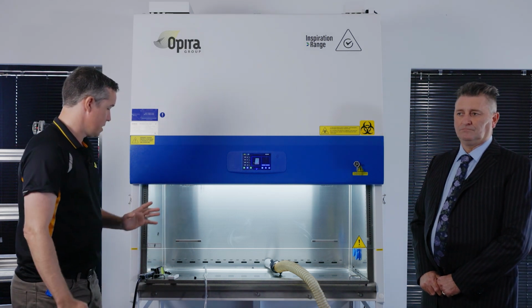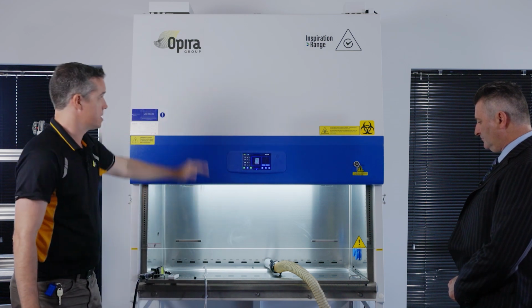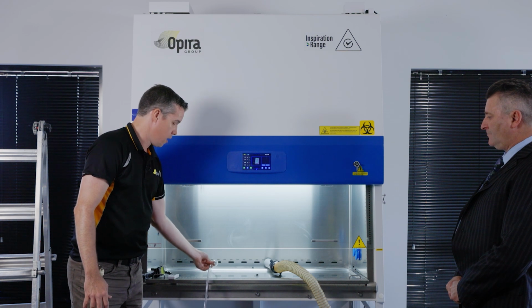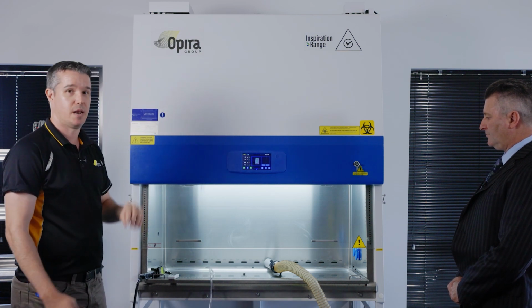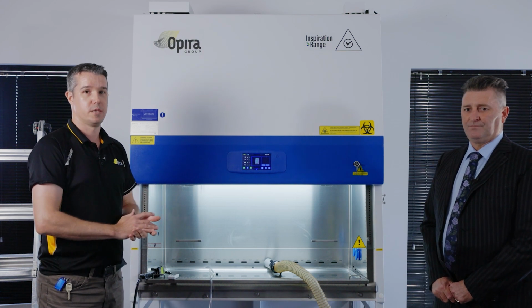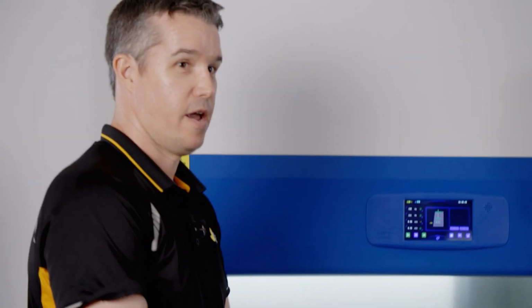So as you can see here, we've got the aerosol generator about to release aerosol into the cabinet. Then we've also got an upstream sampling point where we're going to measure what that 100% is, so that our photometer can be calibrated to know what 0.01% is of that amount. So Curtis, can you just explain what you do before we put the aerosol generator on? You won't be able to hear us once we put the aerosol generator on.